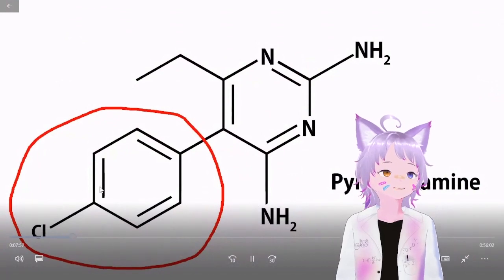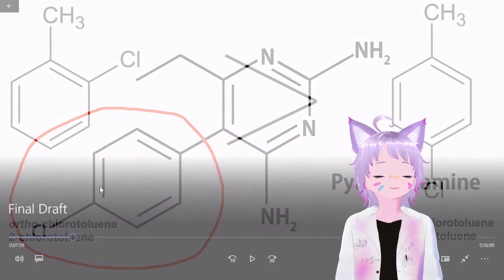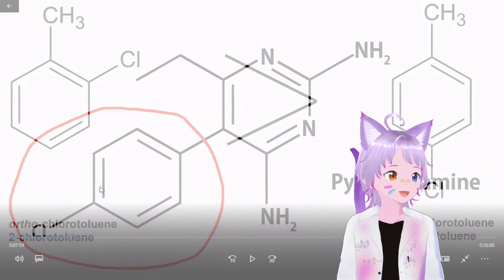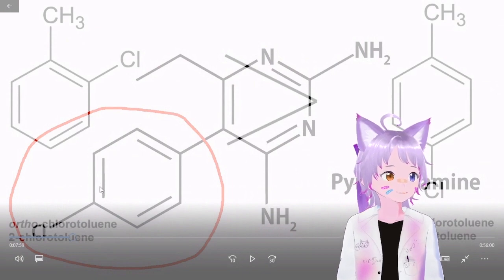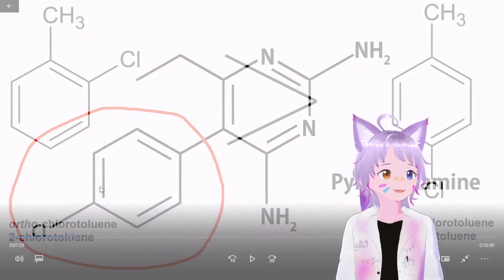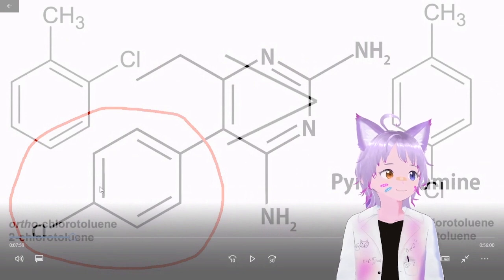He was having an issue with the ratio of sulfuric acid, that's why he had to do it in separate steps. But what if we could just add the sulfuric acid continuously as the reaction progresses? Therefore, we won't have to worry about his problem. Because in his mind, he just added everything right in, right? What if we just have an addition funnel? There you go. It solves the problem. I don't know why he didn't think of that.